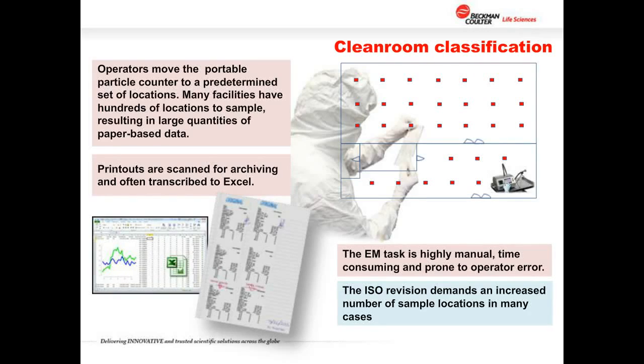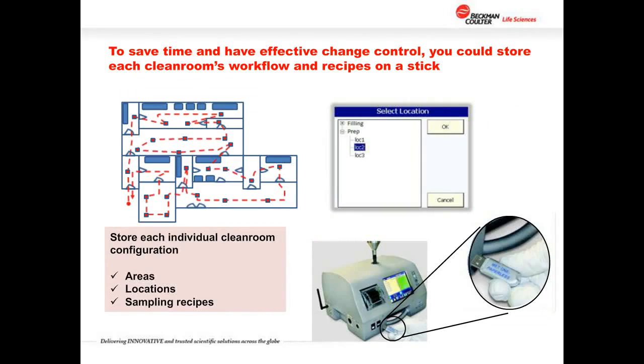And the answer could be yes. So one of the things that is time-consuming, of course, always has been the idea of putting the information together on paper tape and creating some sort of permanent file, whether it's a PDF and or typing it into an Excel spreadsheet or up into a LIMS. That takes time and increases the risk of a transcription error. So one of the things that's possible is to use the electronics of a more sophisticated counter to help out in the process. Many counters today have, in essence, a small computer built into them, almost like a laptop built onto a particle counter.